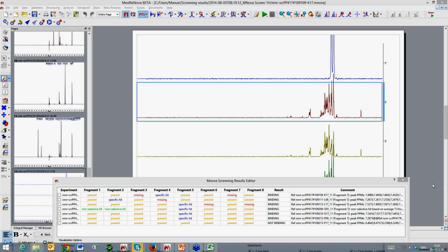Okay, Martin, so the answer is no. You don't need a competitor at all to perform the analysis. You just leave that. That is totally optional. It's not something that we are making compulsory for you. So short answer, no, you don't need it.